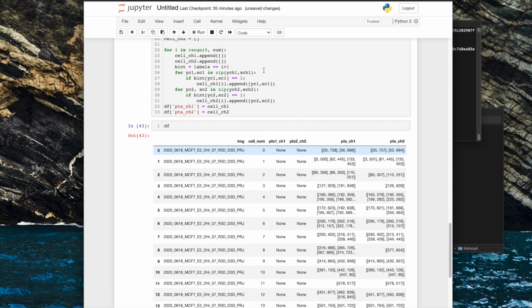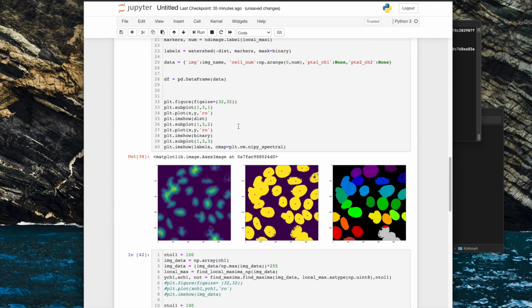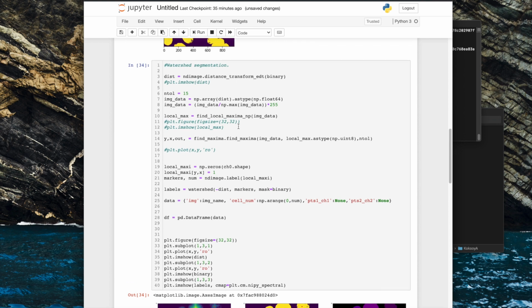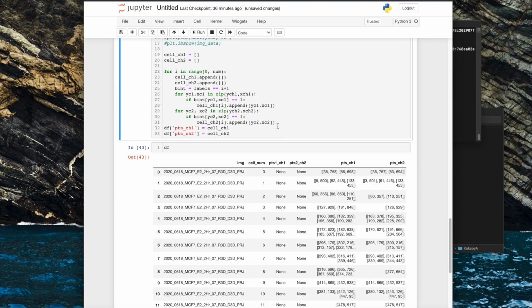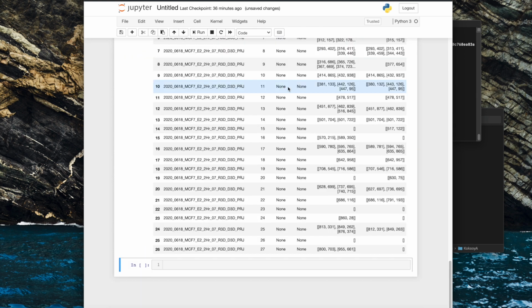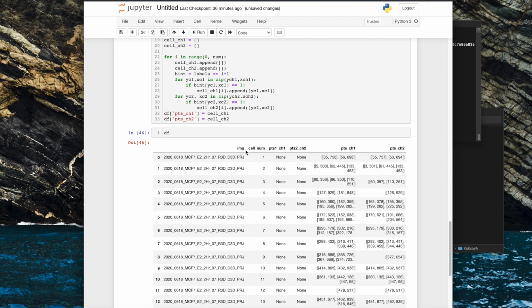It doesn't actually correspond to the actual value in the image, so I think what I will do, just to make it more simple, is to actually do that so it does. So here we'll have between 1 and +1. So now when I look at the data frame, this goes between 1 and 27, which is just the values that we actually have in the label image, so everything corresponds.